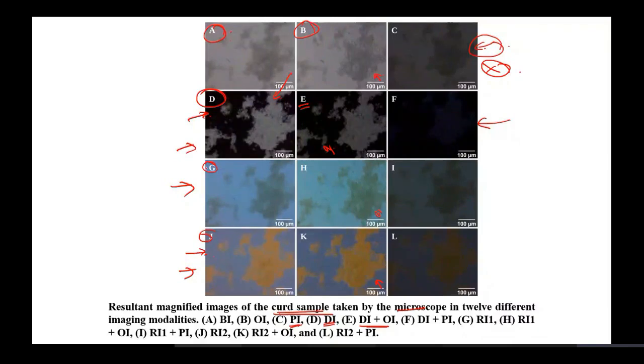However, when we use a colored filter, the dark area in the dark field imaging gets the color in the central part. In bright field imaging, the central part usually has white light, so we get a white background. However, in the rainbow illumination we have a different color at the central part, so the image background acquires that blue.